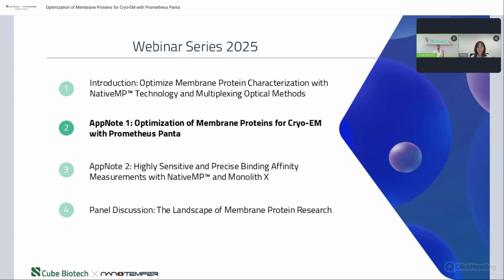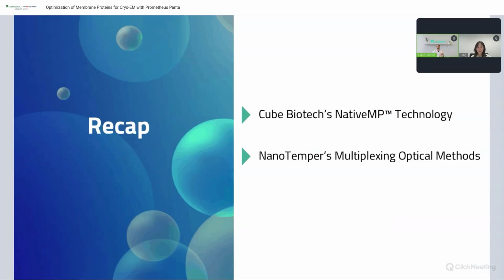Today's focus is on real-life data and what it teaches us about solubilizing, stabilizing, and ultimately preparing membrane proteins for high-resolution cryo. We're going to walk you through some case studies and introduce you to a workflow that we've developed in collaboration with Greg Dodge, formerly at MIT's Barbara Imperiali lab and now at Amgen. Barbara, Greg, and the team provided us with a data set that we're going to analyze together today. Ultimately, those examples have shaped how we think about copolymer selection and validation.